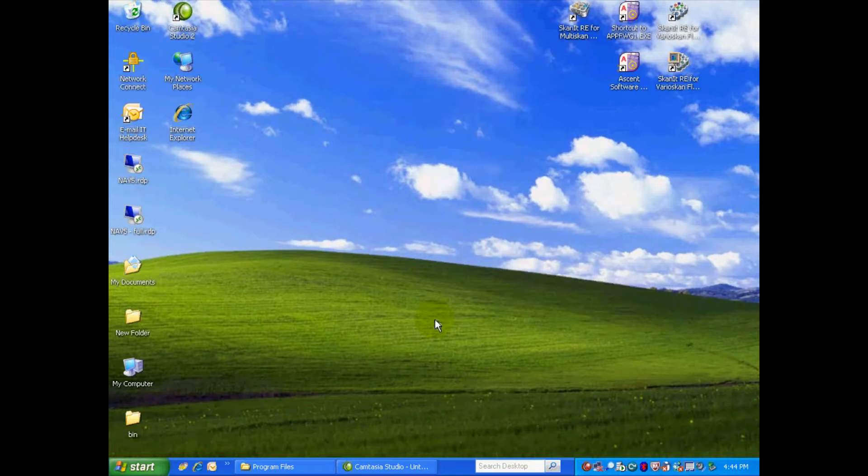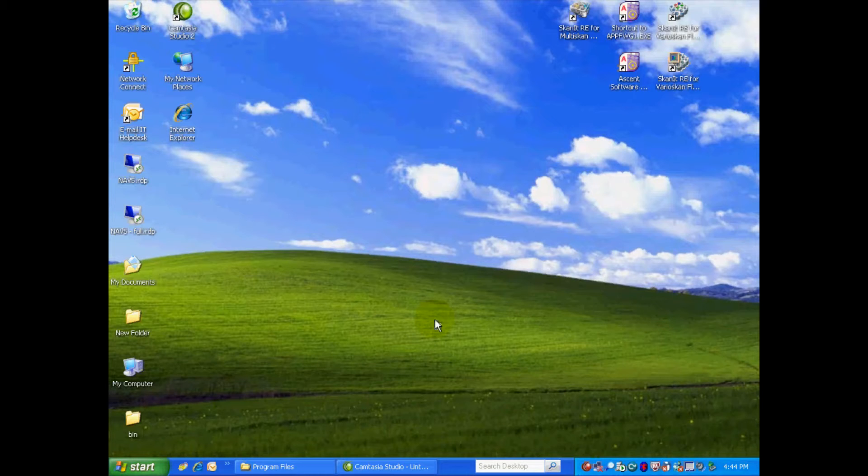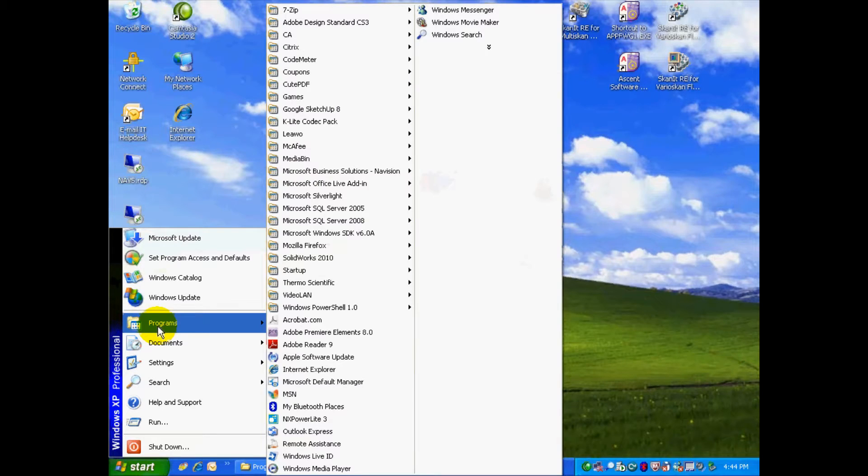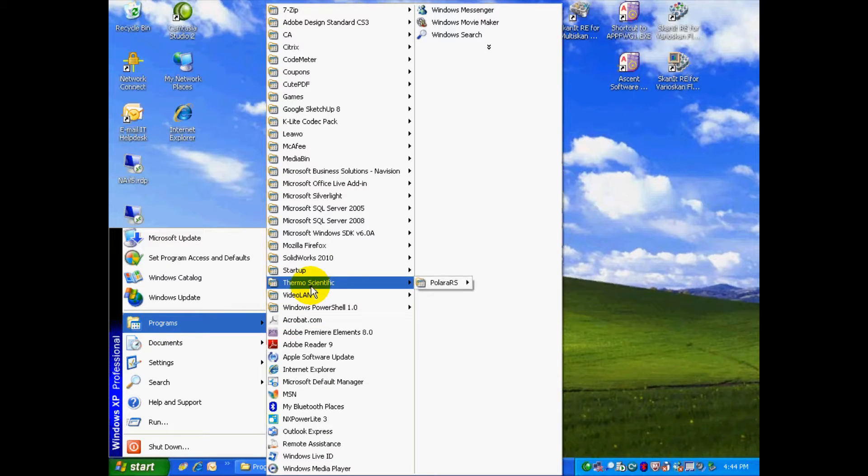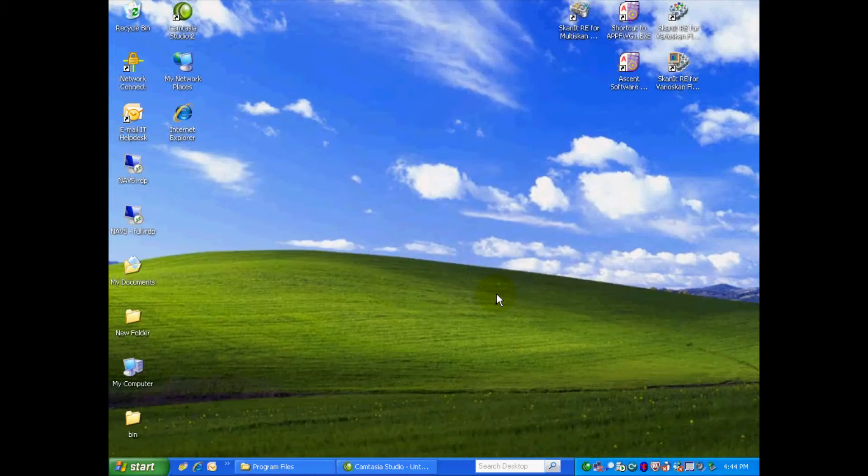The first thing we need to do is open Polara RS, which is the control software for the Rapid Stack that communicates with the Multiscan Go. Where we need to go is the start, programs, Thermo Scientific, and open up Polara RS.